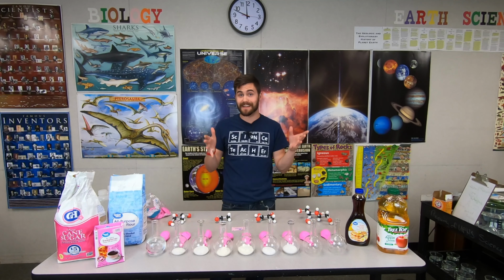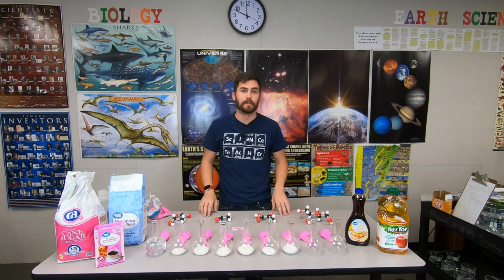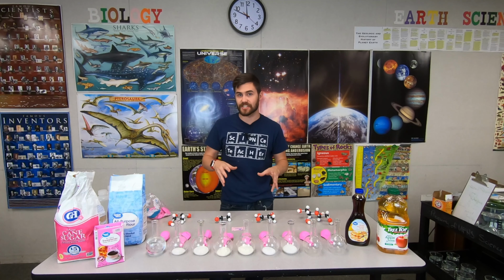Hi, welcome back to biology. In this video lab, we will be investigating the process of fermentation.